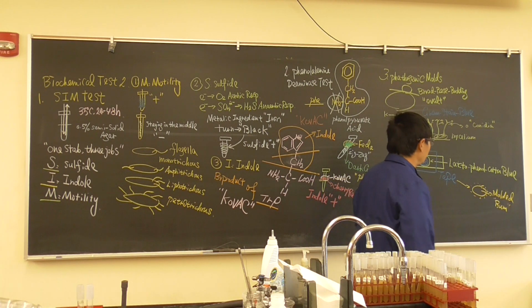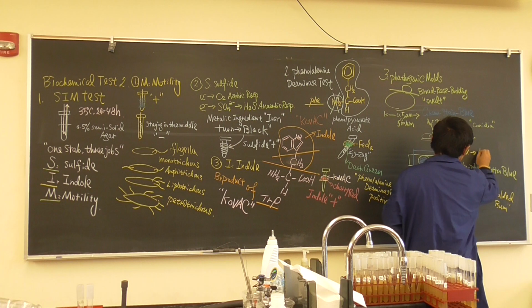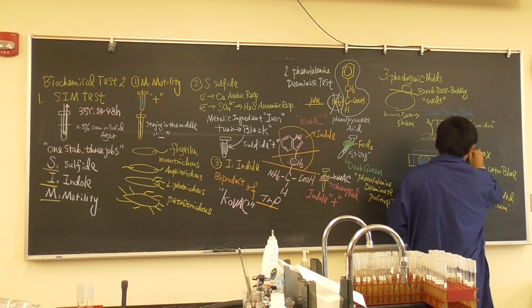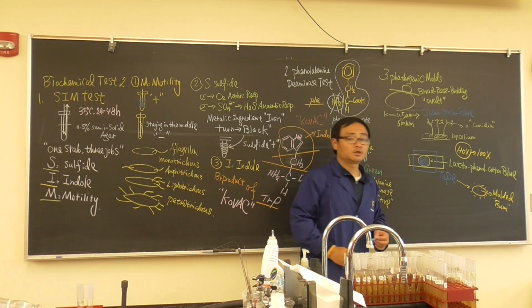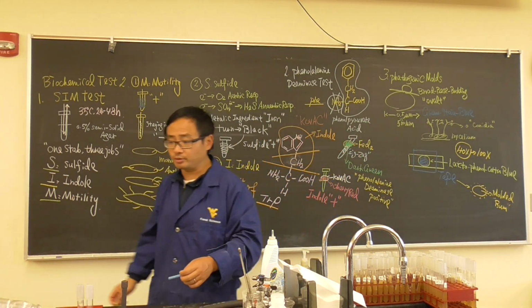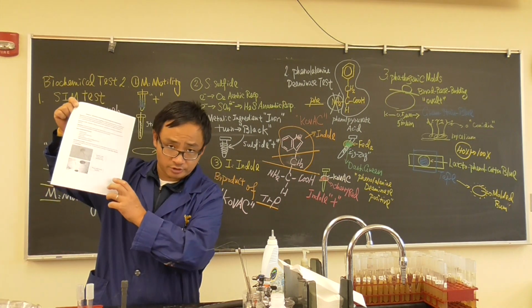Under the microscope, we're using 40x, transferring to 100x. And most of the time you use 40x to see the morphology. Now, why is the morphology important? Look at your fact sheets.